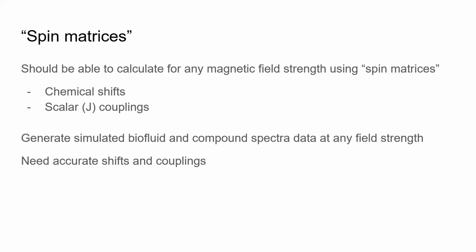To do this, we need to obtain accurate chemical shifts and couplings for all these compounds.